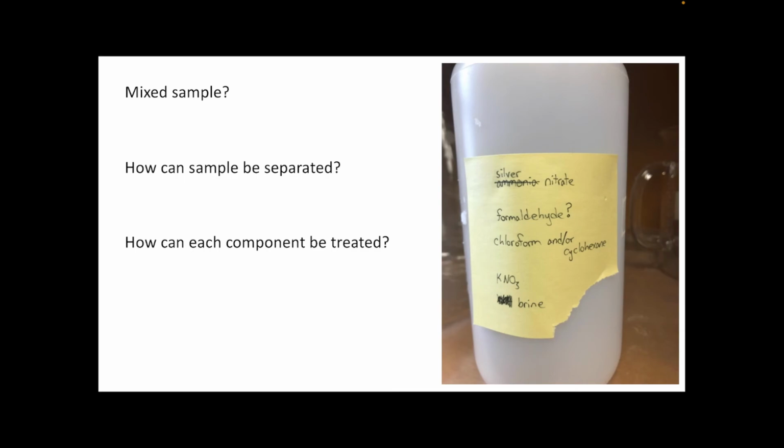You may also wish to refer to something like a hazardous chemical waste treatment guide. And I've included at the end of this video a number of waste treatment processes for some of the chemicals that are listed on this label. And the treatment guidelines that are shown at the end are from the book Hazardous Laboratory Chemicals Disposal by Margaret-Ann Armour, who was a Canadian chemist.